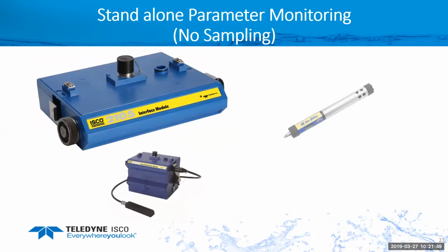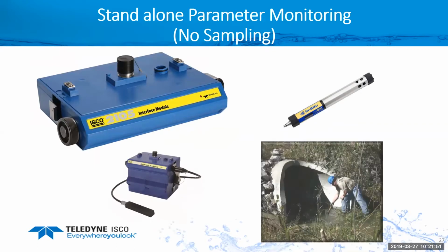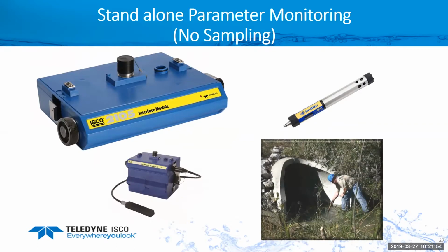So if you want to do a standalone parameter monitoring, here you can use a 2105 and a sonde. We have a gentleman down here in the water right here. He's just got a sonde hooked up to a flow measurement device, in this case, the 2105 interface. So it's actually just measuring parameter monitoring. There's no sampling going on here. No sampler. It's just monitoring those parameters. In this case, I also have a 2150 labeled here. So you could put a 2150 in there to get flow measurement with your parameter monitoring. Again, there's no samples being taken.